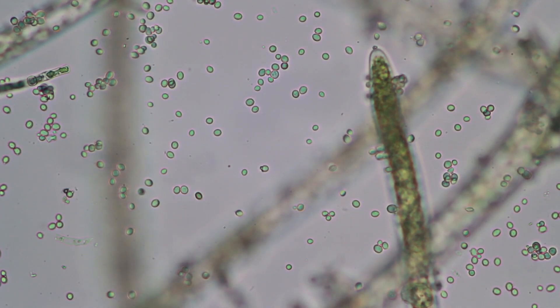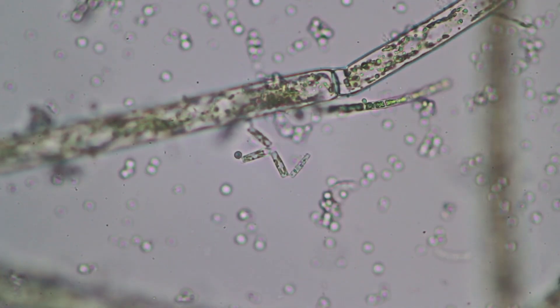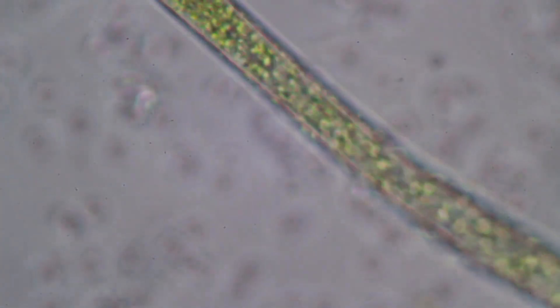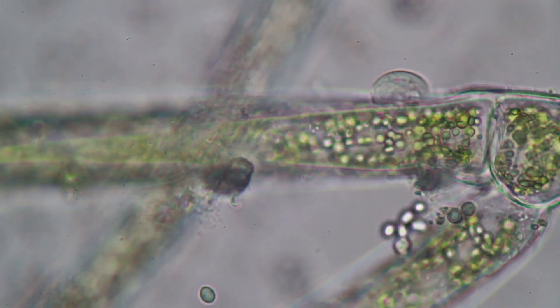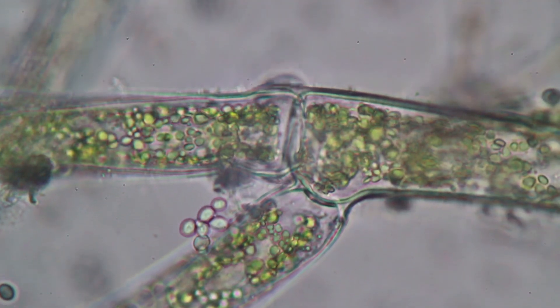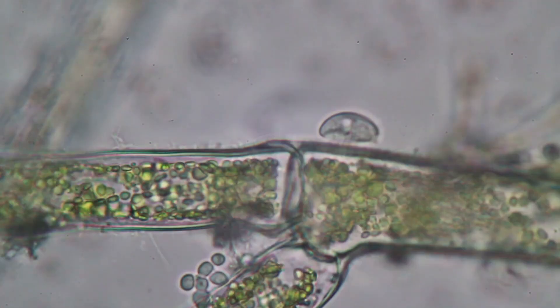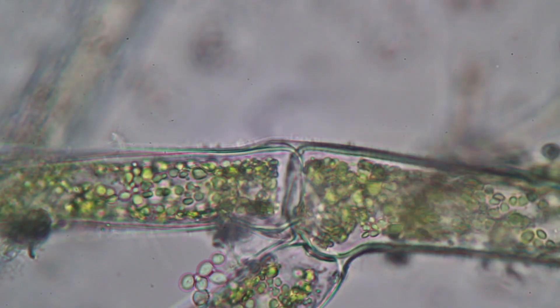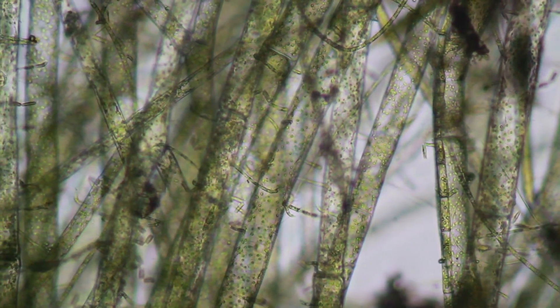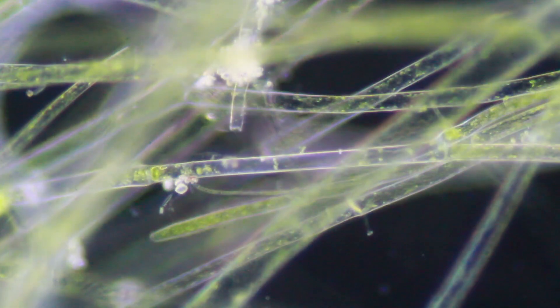On first sight there are a few diatoms you can see, and again algae — you can see the chloroplast inside. There was one actually swimming around, some kind of ciliate. Also interesting to see on the very right-hand side how the algae is branched, and also where the different cells touch each other. This guy is going in a circle. It looks a little bit like a forest — very dense. I'm moving around trying to find some interesting things. This is in dark field and you can see the nature of the image is quite different here.